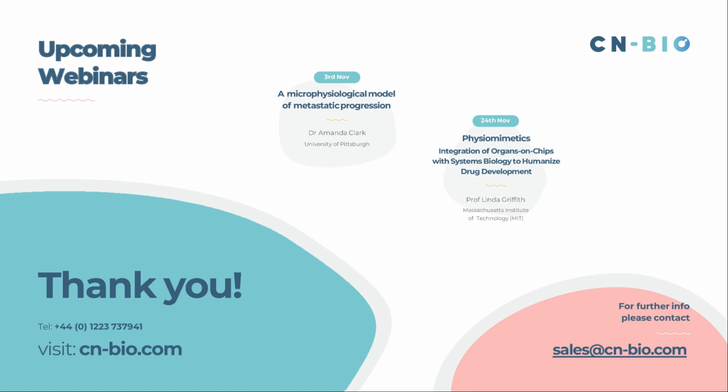From a disease state perspective, generally setting up a disease state in the system takes a little bit of time, a minimum of somewhere around a week normally, for example, to induce the fatty liver disease state that I showed there in one of those final slides. We've done other things with sort of viral infection, etc. These normally take a good few days up to a week to initiate, and then we can look to add therapeutics into the system. The system is very stable. We run our platforms generally for a couple of weeks up to a month, so we have a good window to do these kind of studies.